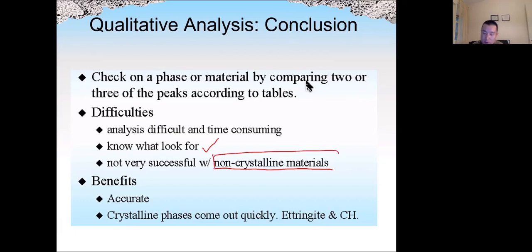This is important. Again, for glassy materials, the d value is not fixed, it's changing. So we cannot identify non-crystal materials using XRD. The benefit is the method is accurate. We can quickly identify what types of phases are in the sample.